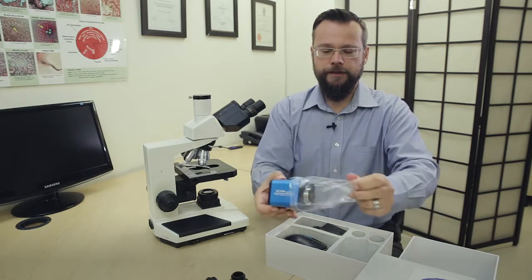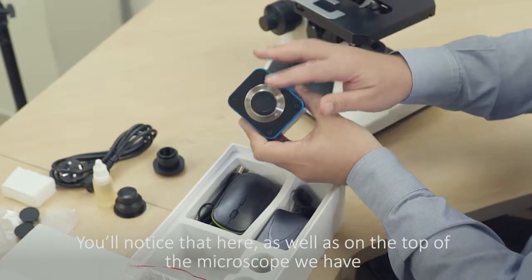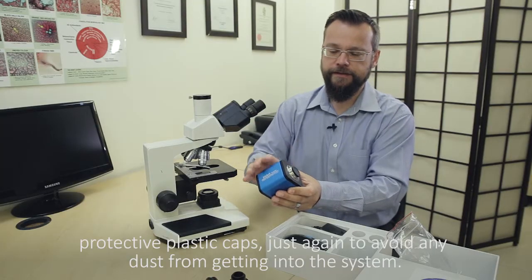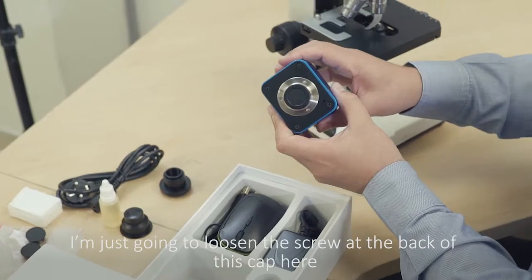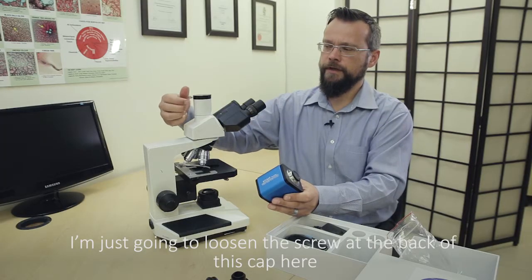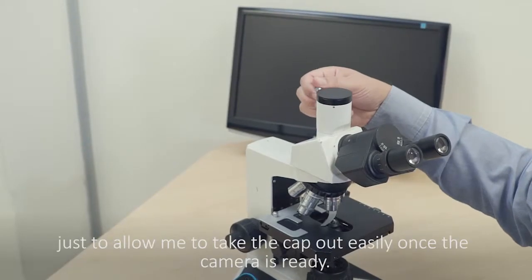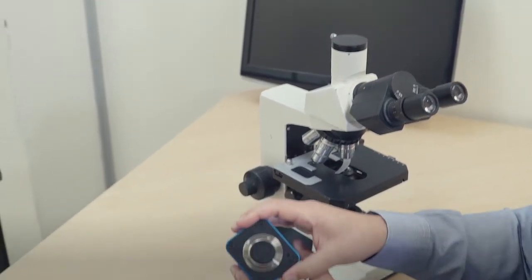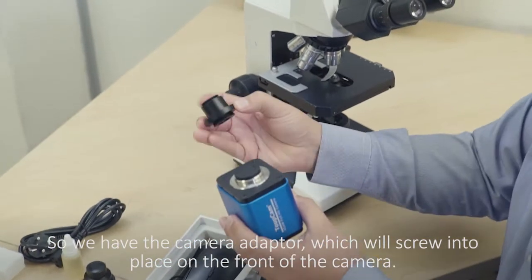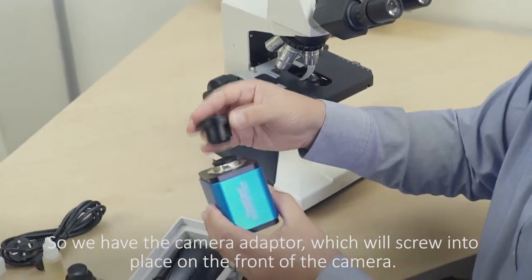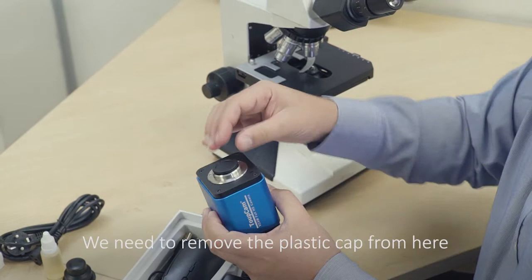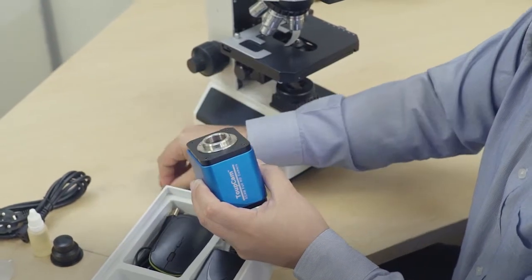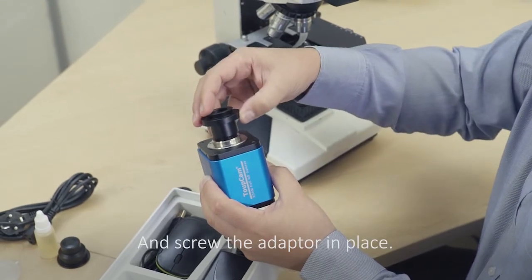You'll notice that here as well as on the top of the microscope we have protective plastic caps just again to avoid any dust from getting into the system. So I'm just going to loosen the screw at the back of this cap here just to allow me to take the cap out easily once the camera is ready. So we have the camera adapter which will screw into place on the front of the camera. We'll need to remove the plastic cap from here, screw the adapter in place.